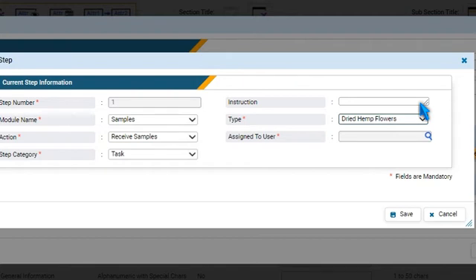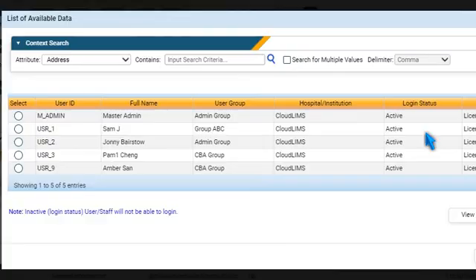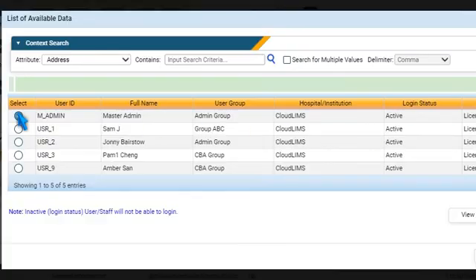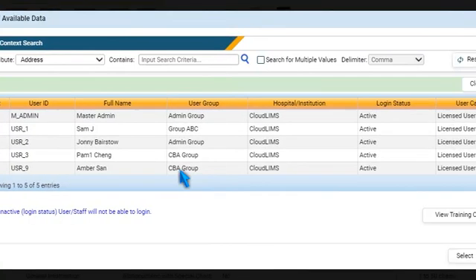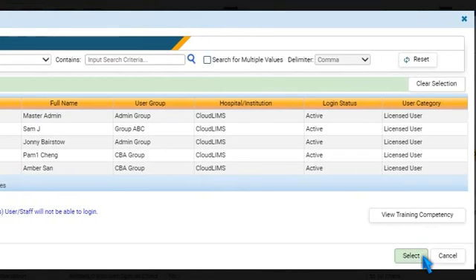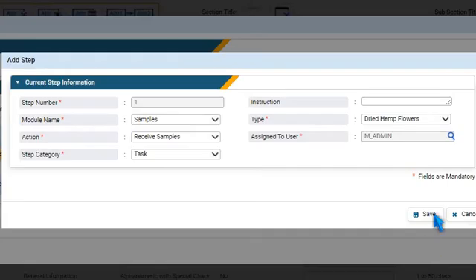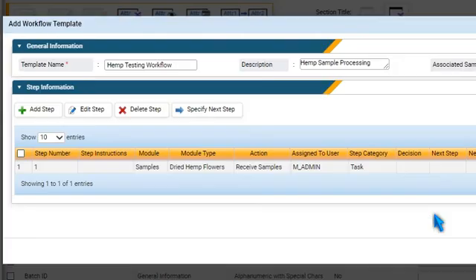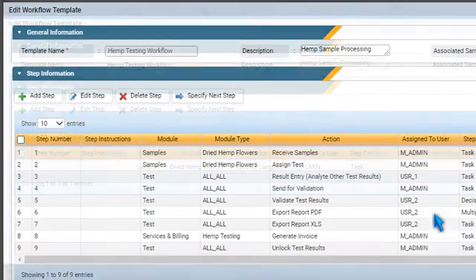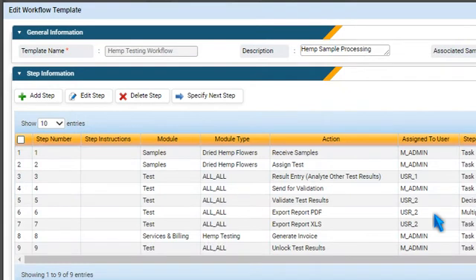To assign the step to a technician who is trained on the job, press Browse. Choose a user, press Select, and then Save. Similarly, you can add multiple steps to the workflow template.